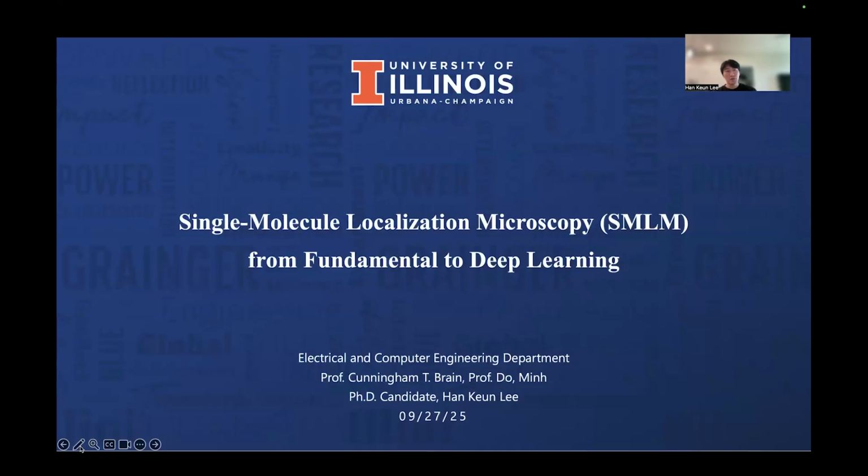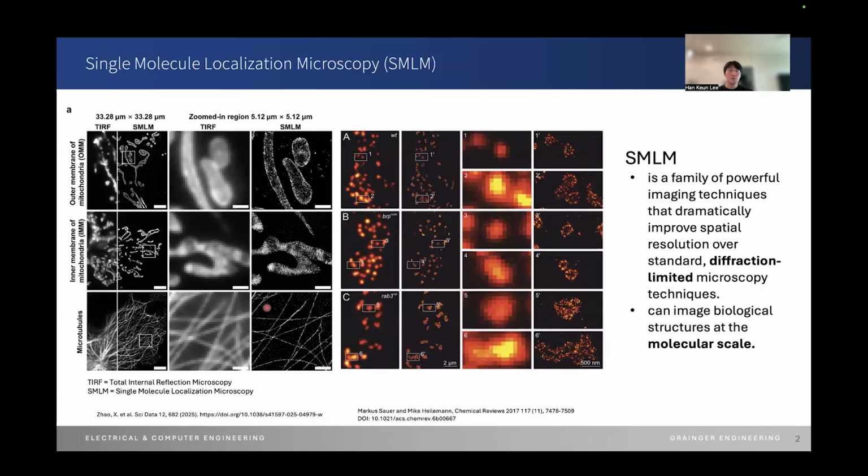The title of my presentation is Single Molecule Localization Microscopy, SMLM, from Fundamental to the Deep Learning. Single molecule localization microscopy is a family of powerful imaging techniques that dramatically improve spatial resolution of standard diffraction limited microscopy techniques. And it can also image biological structures at its molecular scale.